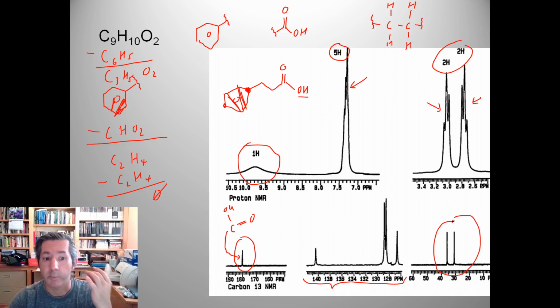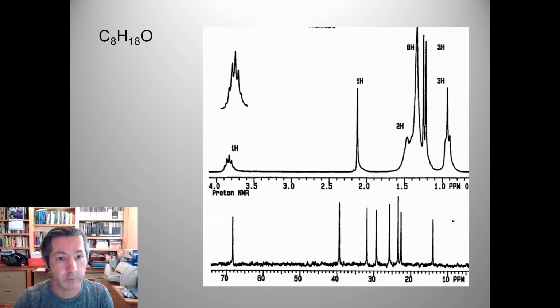So, and that's what you do. You put those puzzle pieces down on paper. So whenever you see a puzzle piece, put it down. The structure will not just jump right out at you. Let's see. And one other thing I want to show you, just another example.